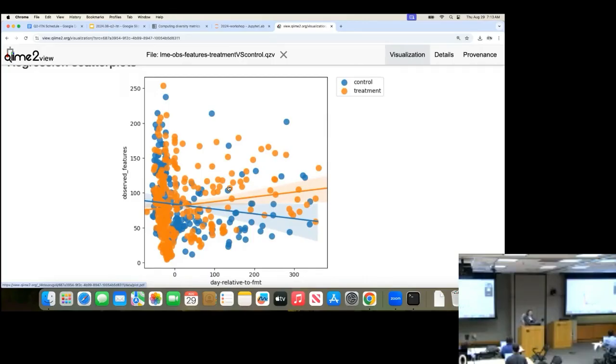And I'll kind of recenter us back in our objective of this study, which is that after stem cell transplant, it's so important to regain healthy, high alpha diversity in the gut microbiome, because it leads to better clinical outcomes. And so we're trying to see if we can raise that alpha diversity. And here, looking at these trend lines, it looks like maybe the FMT was successful in increasing that alpha diversity compared to the control group, which didn't receive an FMT.